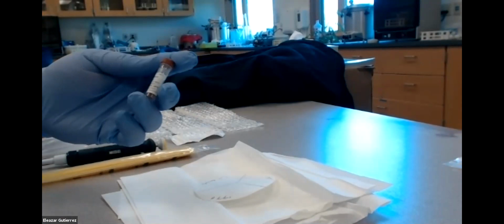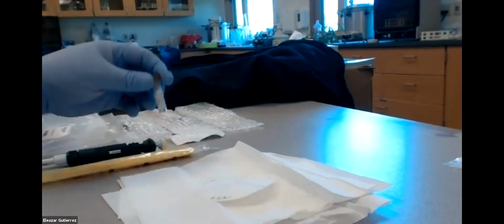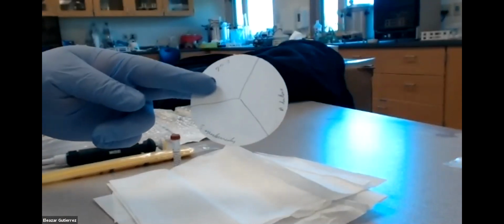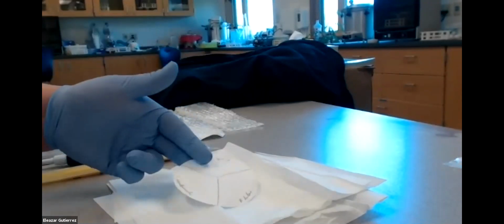Okay, so here we are. We're going to test for oxidase. And for this, we need the oxidase 1 ml, this little guy right here. We need our filter paper. And I'm aware that the author says to cut into 3 parts, but I really don't see why. It's not like we're going to cover the whole thing in bacteria.